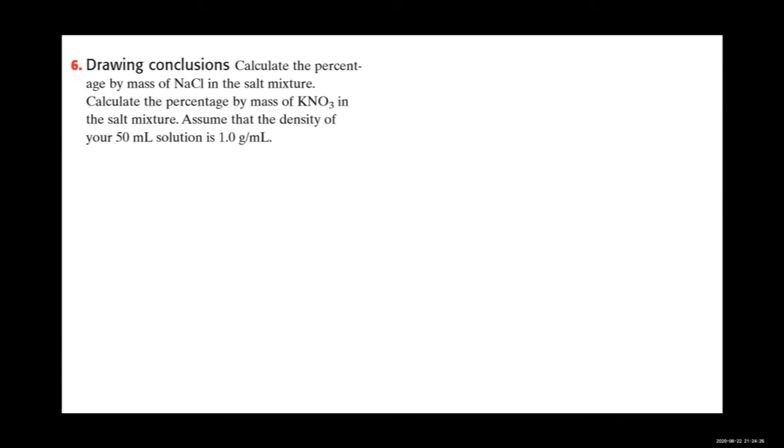Calculate the percentage by mass of sodium chloride in the salt mixture. Calculate the percentage by mass of potassium nitrate in the salt mixture. So here's how we're going to do this.